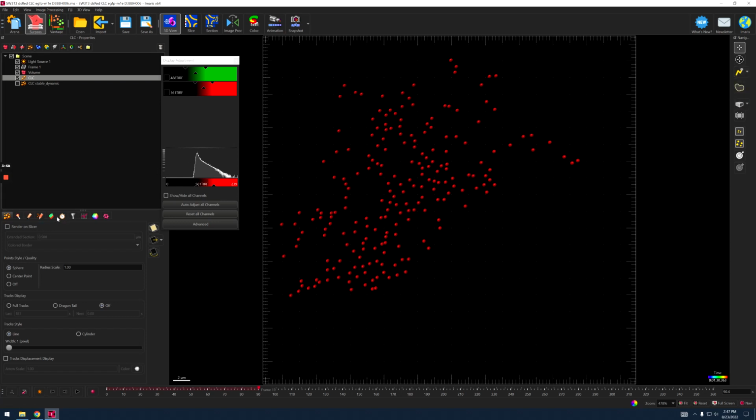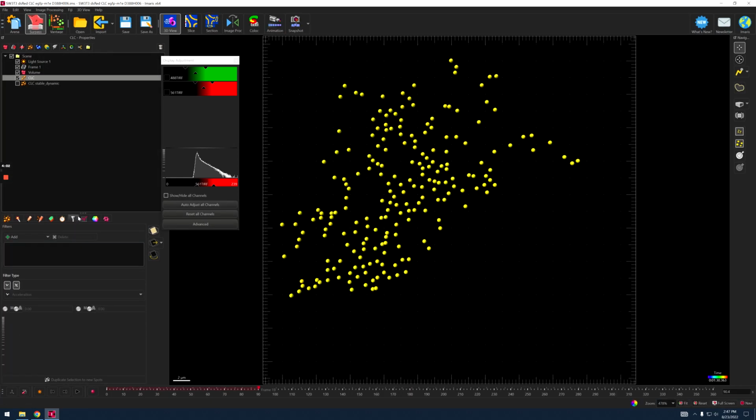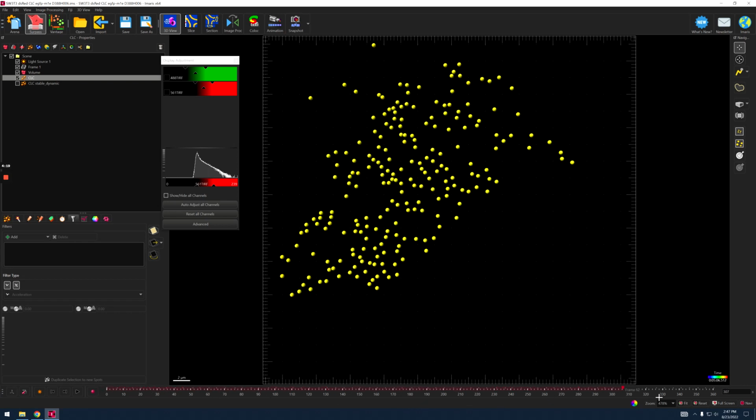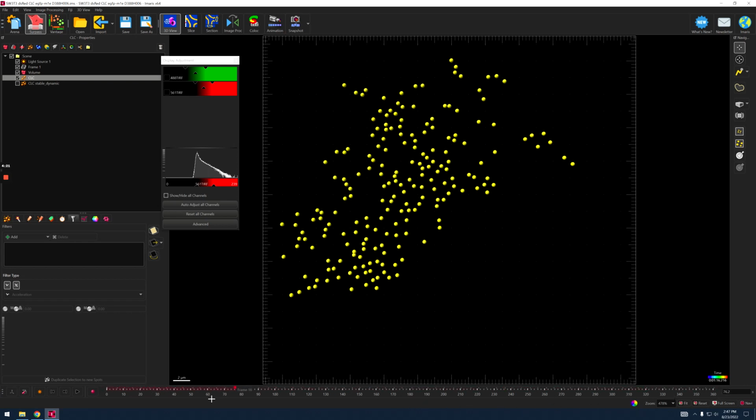So remember to do this. And then I would go to the filter. Once you click the filter, if nothing is being filtered, it will automatically select everything here, so you can go through each of your timestamps and see everything is selected.